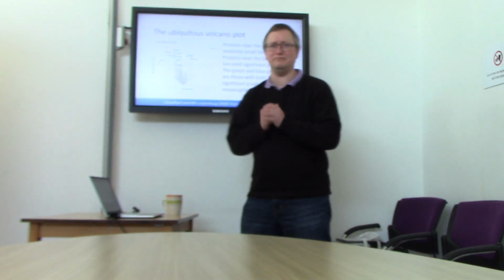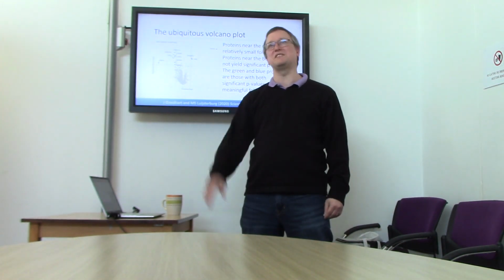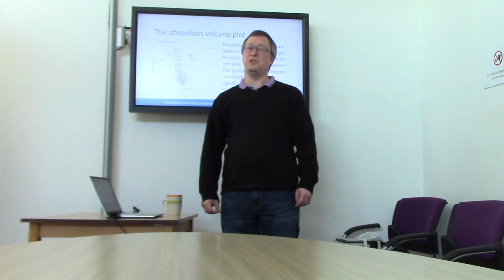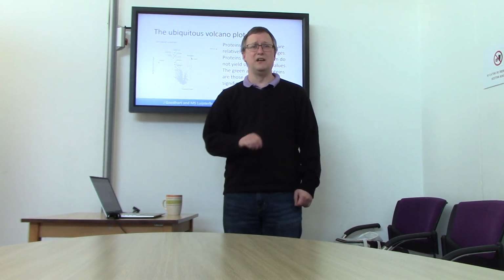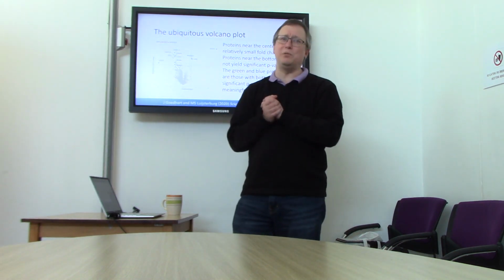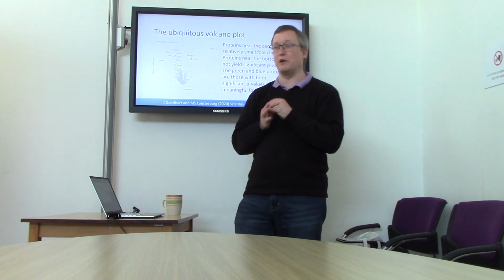All right, volcano plots. Everybody loves a volcano plot, except the statisticians. Statisticians do not love volcano plots, but you should know how to read one. Because very, very frequently, when you have differential expression data from transcriptomics or from proteomics, volcano plots are where we do that assessment. You also see them in stuff like metabolomics quite frequently.